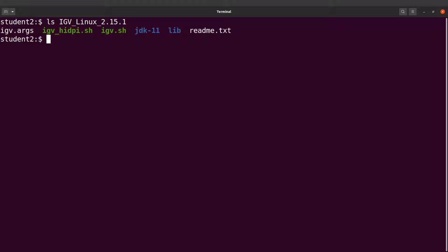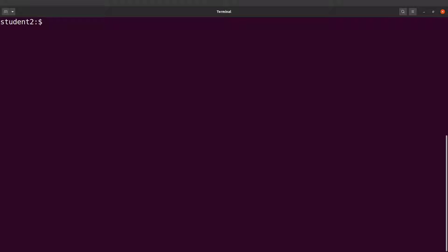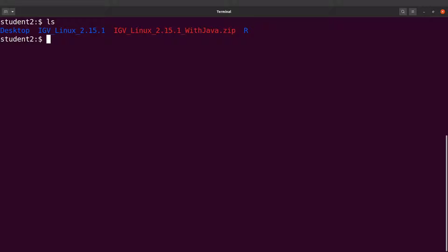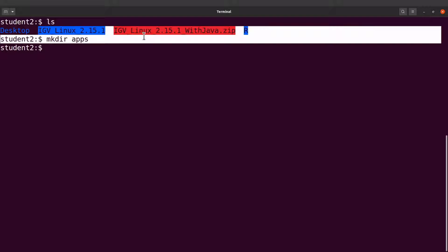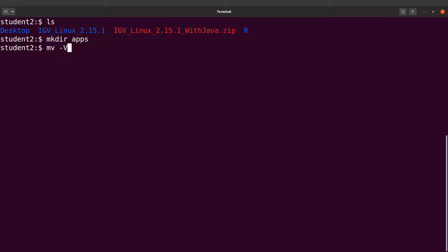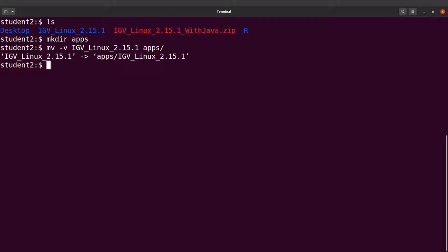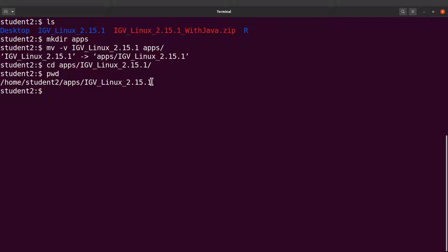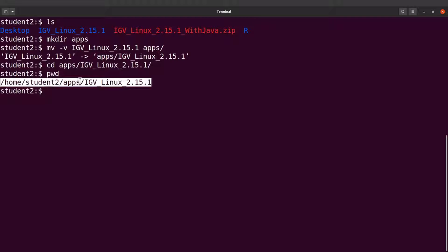Let's organise our files. I'll create a directory called apps using mkdir, then move the IGV directory into it. Next, I'll cd into apps and then into the IGV directory, and run pwd to get the absolute path for that directory. I'll copy this path — you should also copy the path you see on your screen.